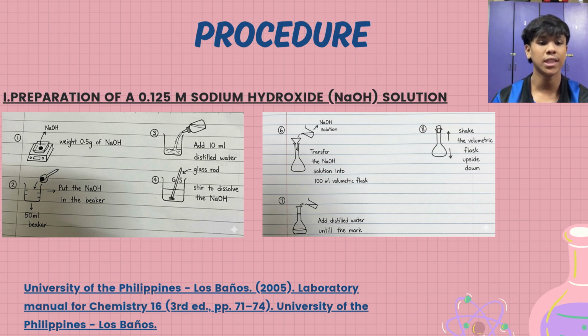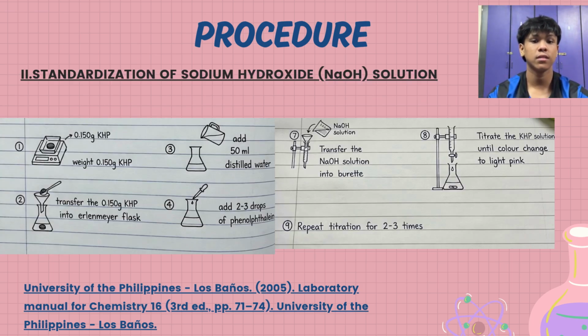After that, we shake the volumetric flask upside down. We move on to the next step. The next step is standardization of sodium hydroxide solution.